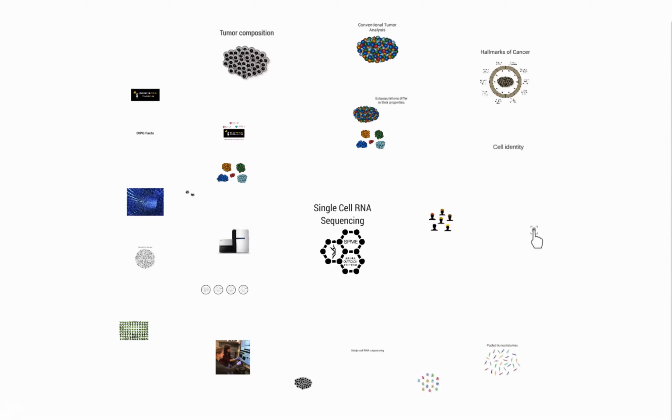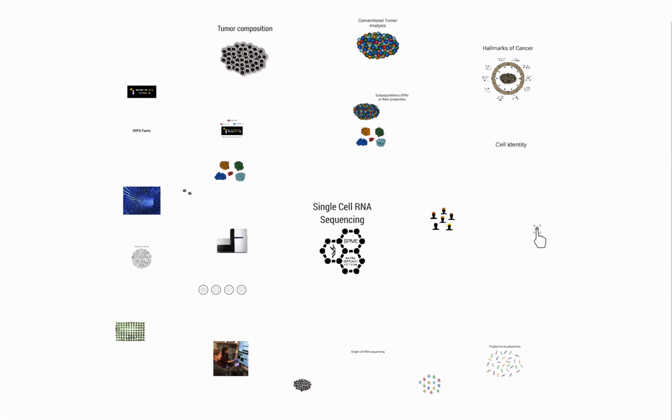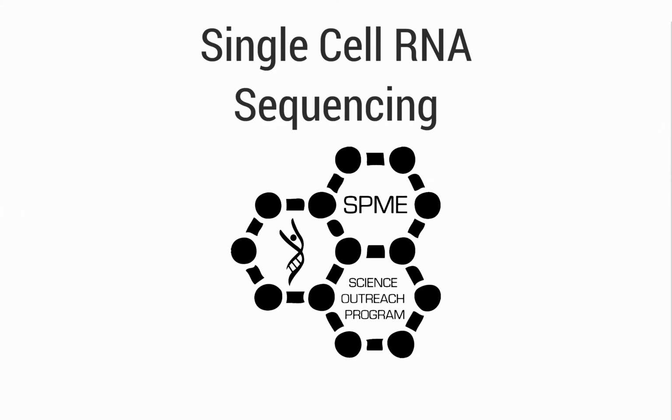In the next few minutes I will try to explain how a new technique is currently revolutionizing cancer research as we know it. This technique is called single-cell RNA sequencing, and it holds the potential to overcome so many problems we are currently facing in modern cancer research.